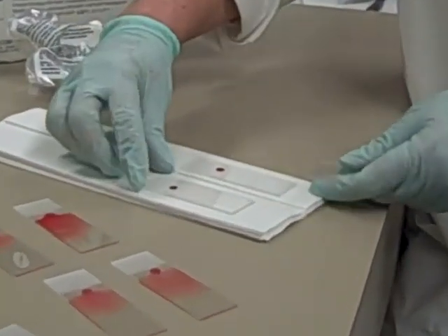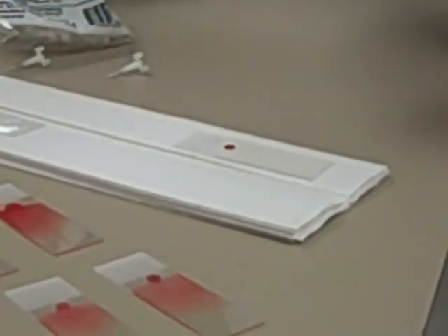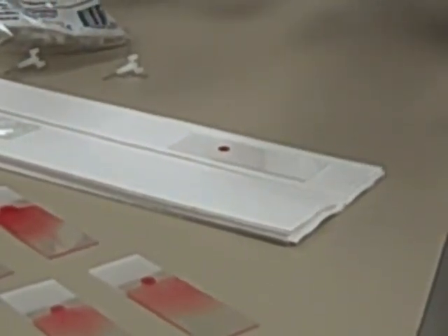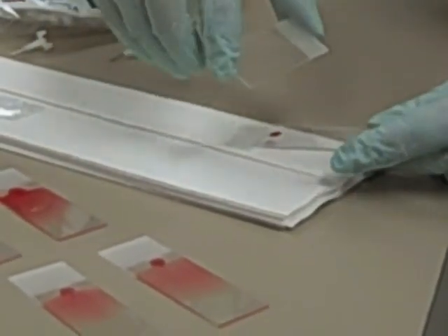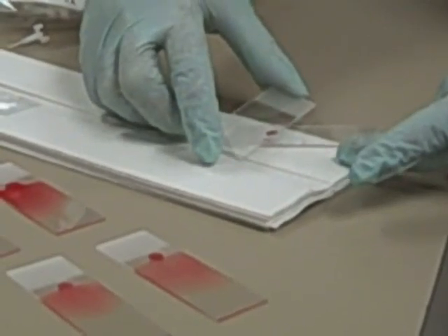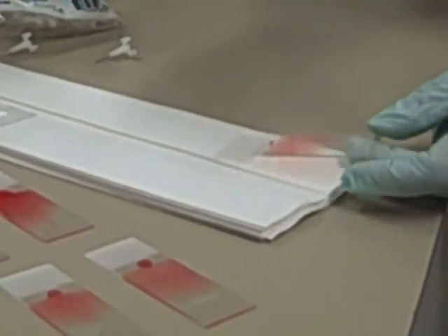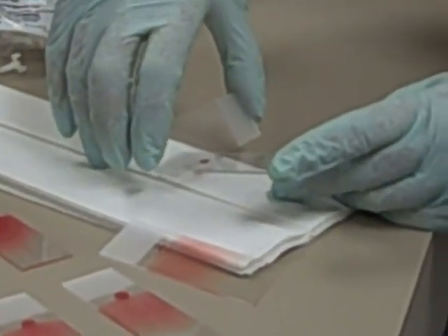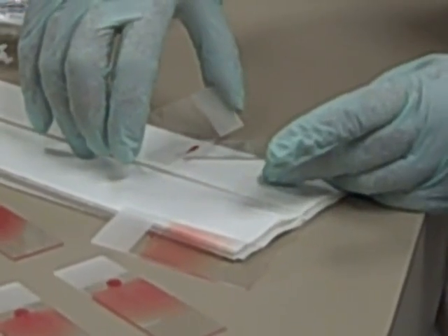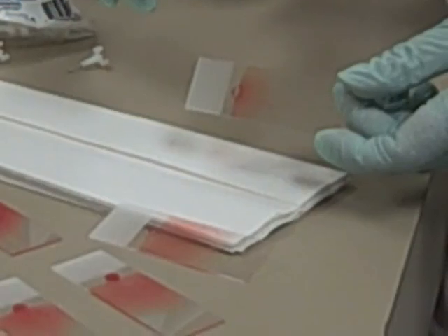The last variable is the angle of the spreader slide. The lower the angle, the longer the blood smear. So instead of 45 degrees, if I go down to, say, 25 degrees, I get a longer smear. If I increase the angle to something like 90 degrees, I'm going to get a short one. So that's the theory today.